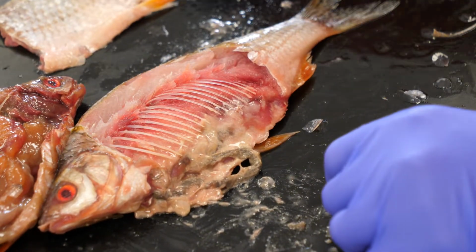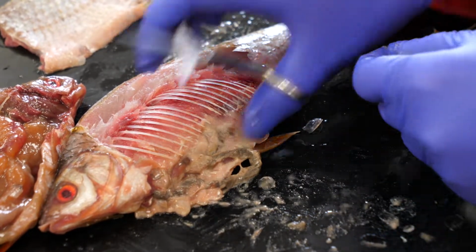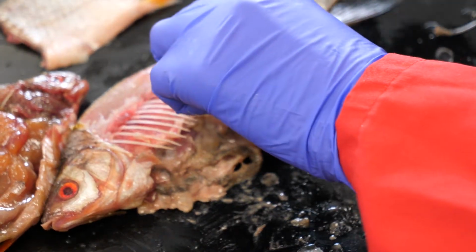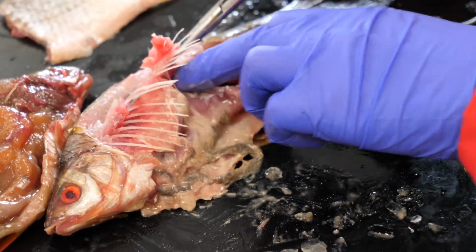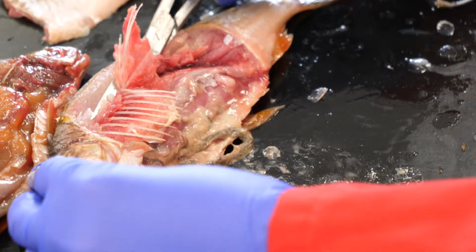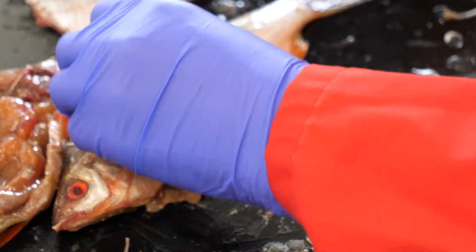So what I'm going to do is I'm just going to finish cutting away the rest of this muscle, so we can see inside. It comes away quite easily. Those of you who cook a lot of fish will know that it comes away quite easily, and you can just cut it quite easily. These are not particularly strong bones.